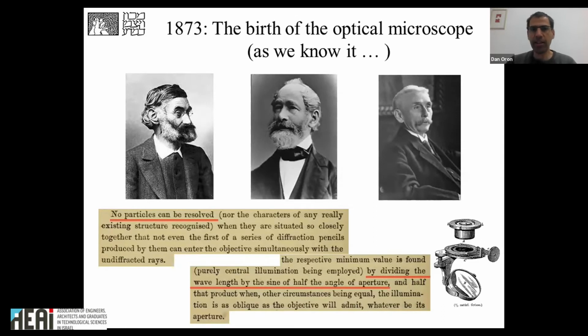And so you could say that the science of quantitative microscopy was born in 1873 and died very, very closely thereafter, because the resolution barrier stated by Abbe was limiting. And there was nothing more to do, right? So surprisingly, it took 120 years for people to start challenging the Abbe limit. But they're not challenging the Abbe derivation. The derivation is completely correct. It goes from Maxwell's equations to a mathematical derivation of the resolution. What may be incorrect in this case is the assumptions underlying the Abbe model.